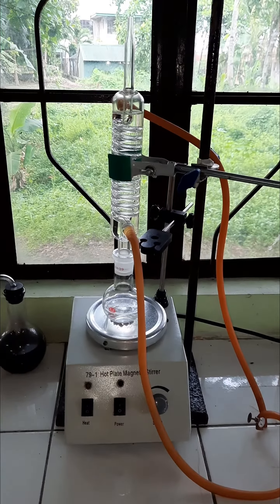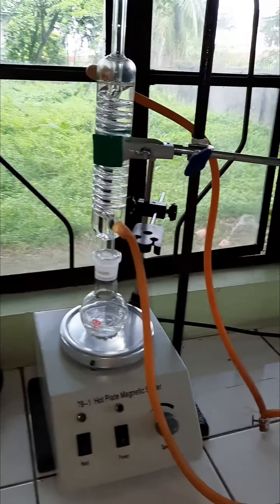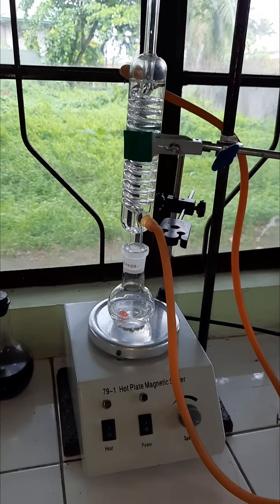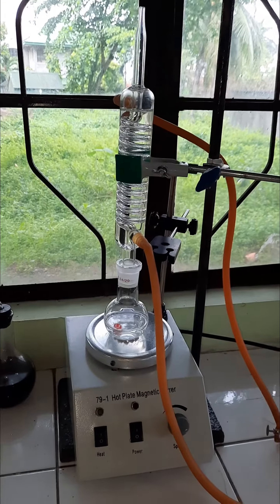Good morning, class. Here we have our reflux reaction setup, wherein later on we will be refluxing ethanol in the presence of potassium dichromate as we oxidize ethanol, turning it into an aldehyde.